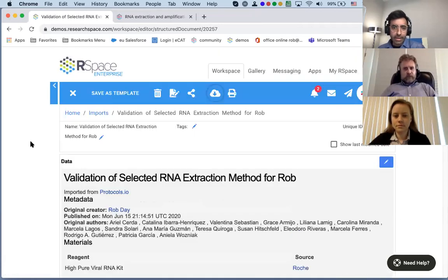Okay, great. We have a couple more questions and we'll try to get to them before we hit time. But one of them is, have you developed any DMPs or data management plans in RSpace?